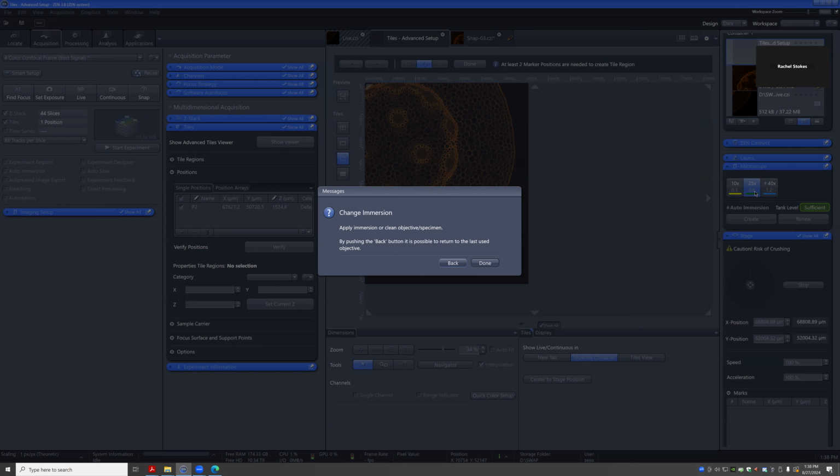The other thing is, you see that now in the software, it shows oil. So this is not in Zen, it's a hardware configuration file. We should set it to water there as well. Otherwise, it'll just keep saying oil. Right, and I think that's going to be confusing. Confusing, yeah. Okay, so we'll do that. Let me write that down too.